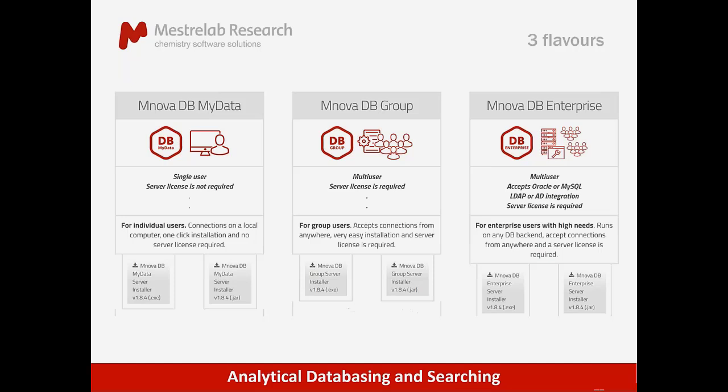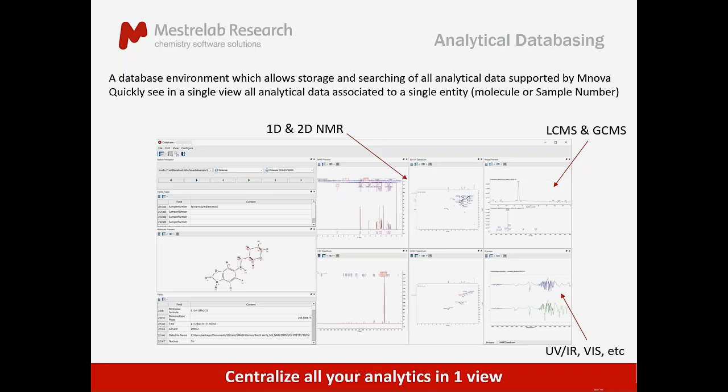Today, we're going to be using the simplest one, especially because what we had to achieve was to get you to have a database running on your computer just by following instructions from an email today. And then I've got the brief of, in about 25 minutes, show you how to use it and teach you what you can do with it.